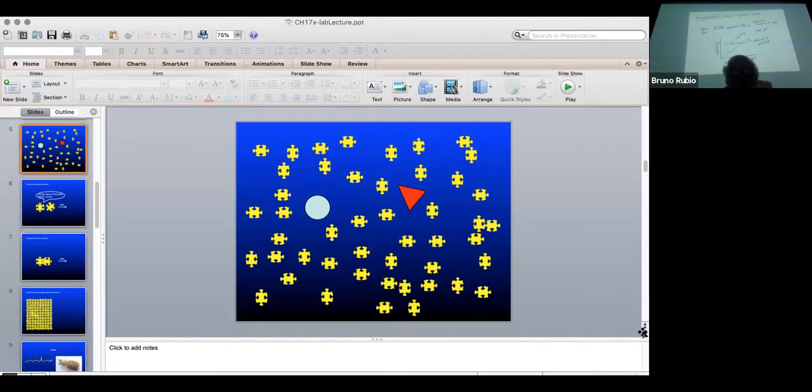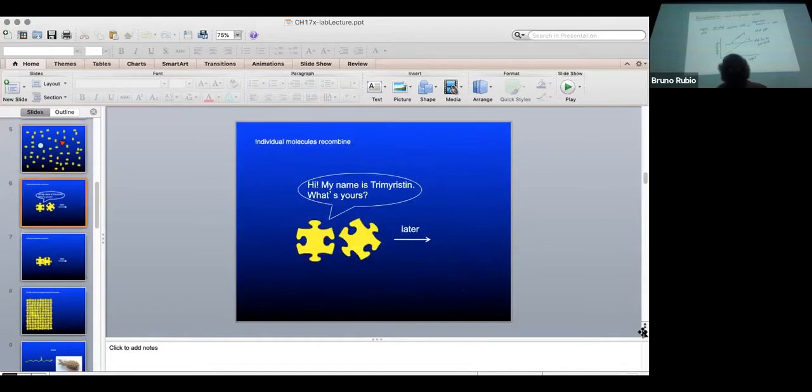Okay, now you cool it down. You cool it down slowly. You don't take this hot solution and put it right into an ice bath or into liquid nitrogen or whatever. You need to cool it down slowly. And as you're cooling it down, the molecules of the solid you're trying to purify bump into each other. They sample each other's space. They know how they should fit together in the crystal, but you have to give them time to find how to combine.